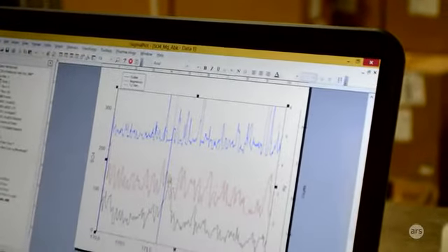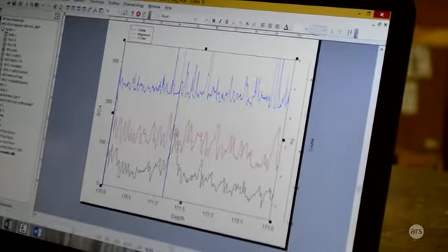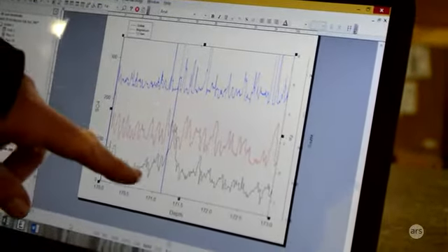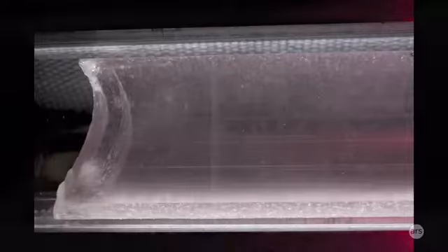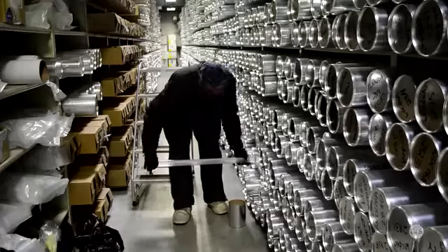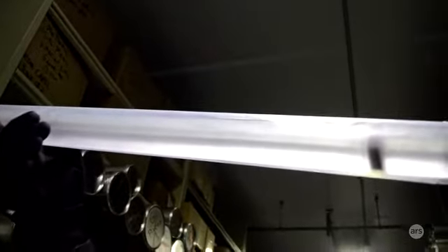The primary dating chemical we're using is from sea salt. So we're using sodium and magnesium to get a beautiful signal that shows every annual layer. We pick up volcanic signals using sulfate, and then that sulfuric acid, which also has an annual signal somewhat. You'll see big increases in it for short periods of time. That's a volcano. We've tied it to volcanoes that we know absolute dates for, and it matches really well.